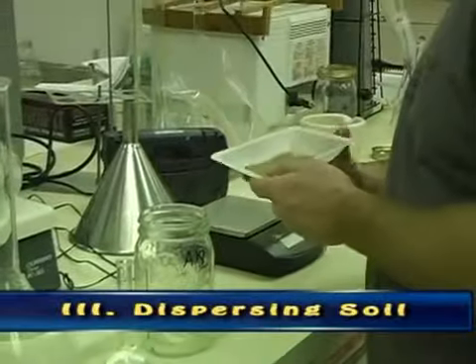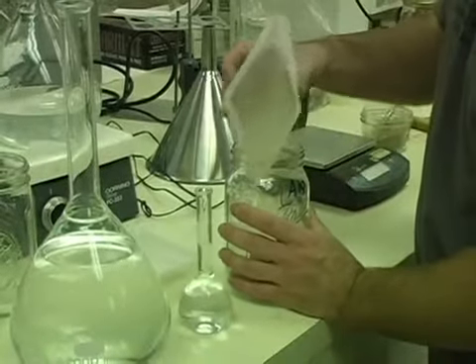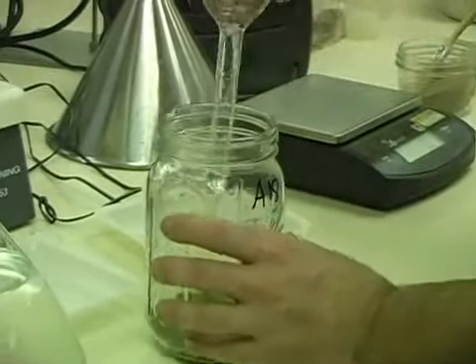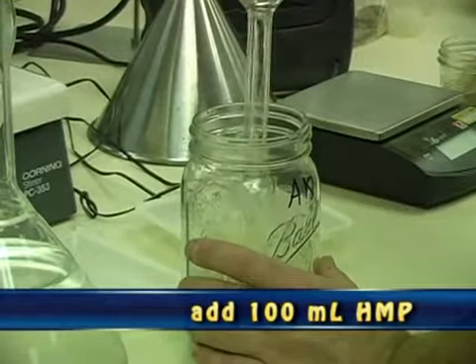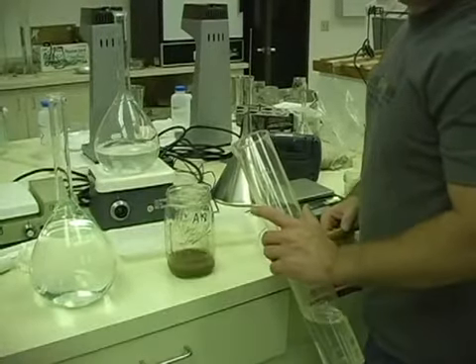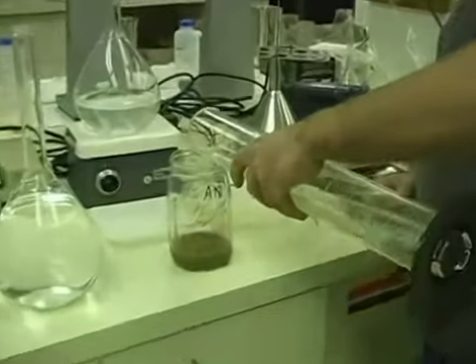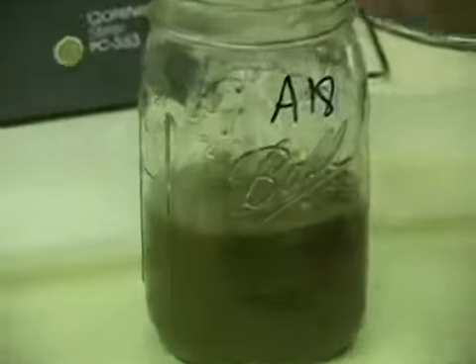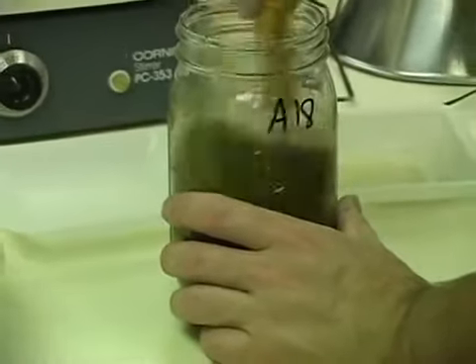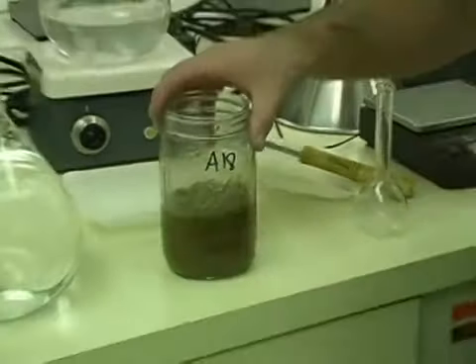Add it to the soil that you weighed out earlier, and put that into a mason jar that's marked with the sample number. You're going to add the 100 milliliters of sodium hexametaphosphate solution, and after you've added the 100 milliliters of solution, you're going to add 250 milliliters of distilled water. And then you're going to mix those together. And then you're going to let that sit overnight.